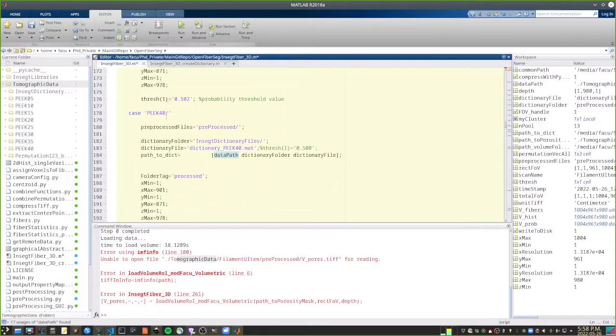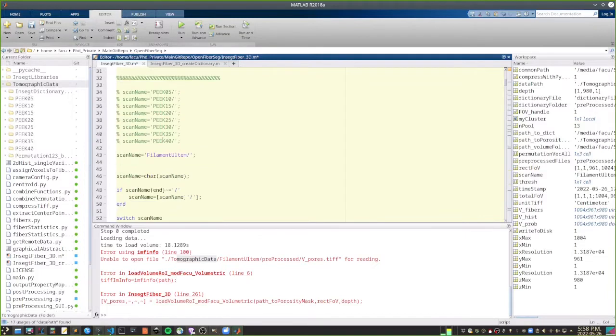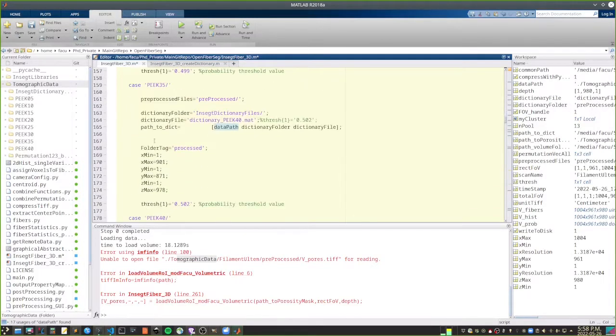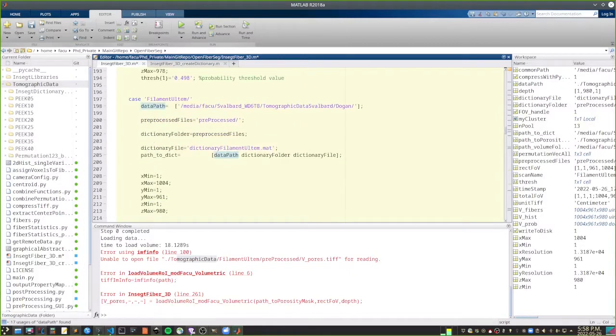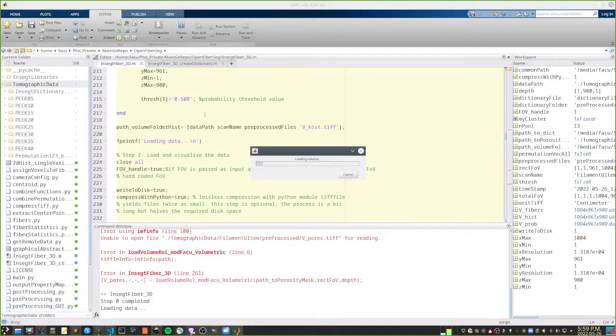These example files already have their data path above here. So for your cases, if you give it a new data path, it's going to overwrite the previous one, and it'll work, and you won't have to remember what you did if you want to rerun the example files.